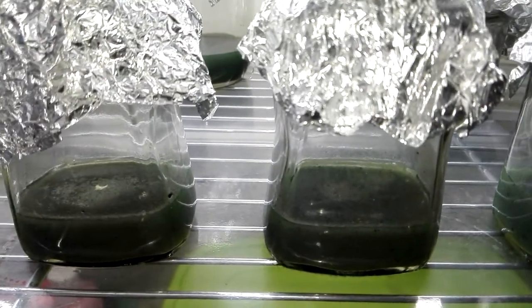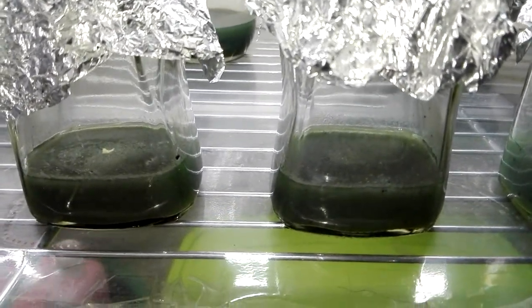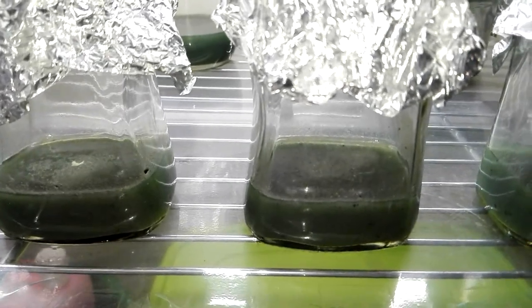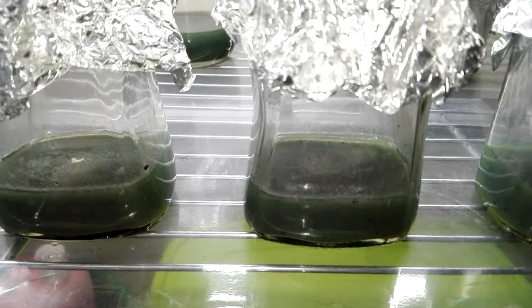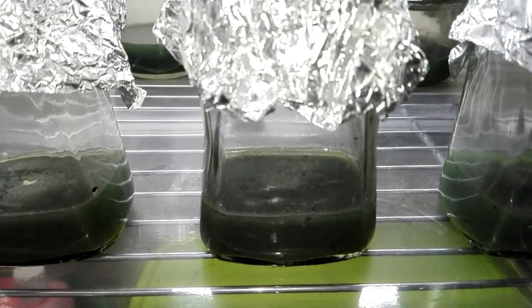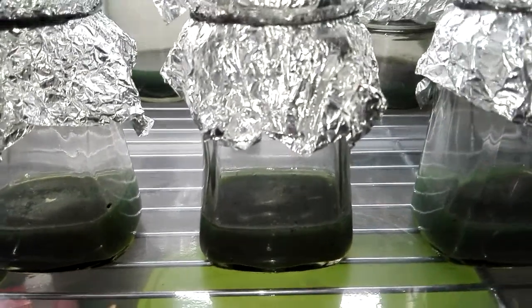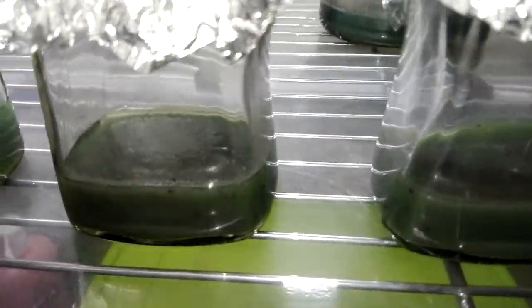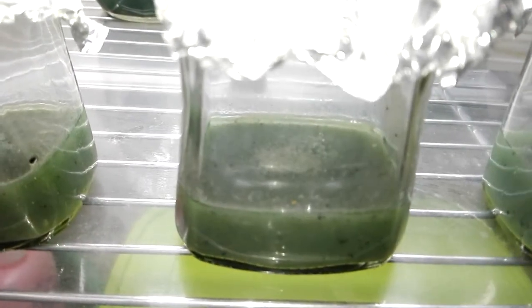Hello guys, this is Ryan of My Mixed Videos Philippines. Today I have already finished my second attempt on propagating orchids from seeds, and here they are. Right now I have 12 flasks, as you can see.